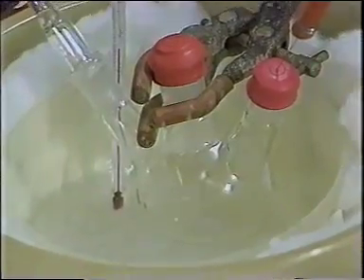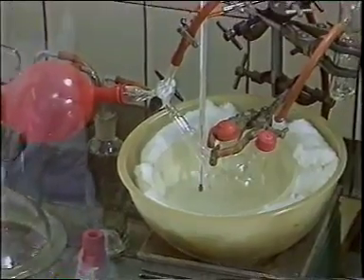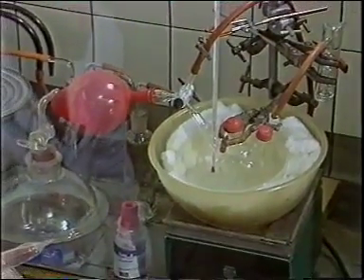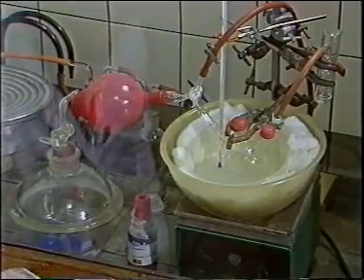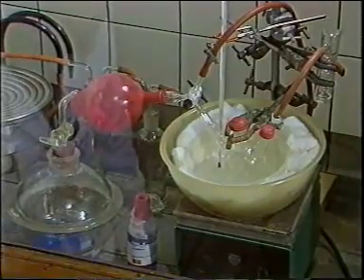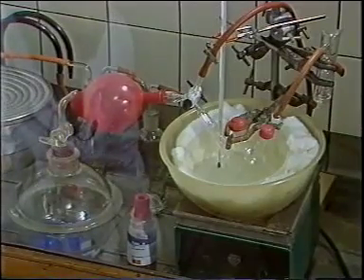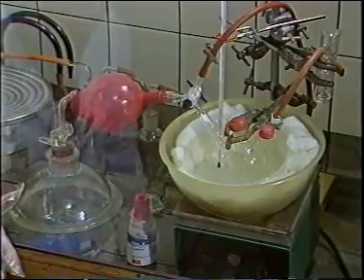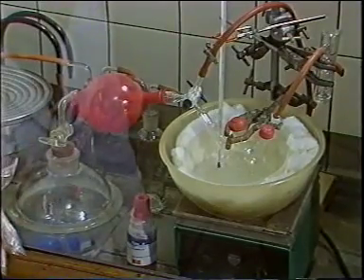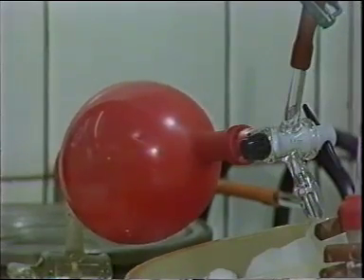All the apparatus here has been carefully dried in an oven and kept in a desiccator until needed. The solvent we are using is specially dried and redistilled THF, tetrahydrofuran. Because the reaction is only taking a short time, I'm using dry nitrogen from a balloon to maintain the atmosphere of nitrogen within the apparatus.